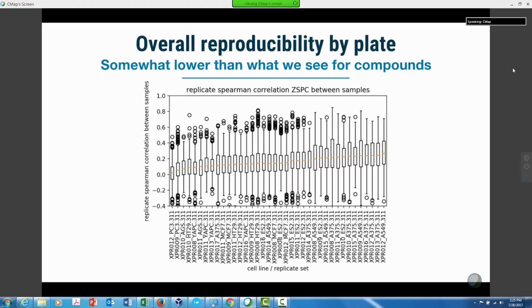One thing that I'm still exploring is that when you look at within-plate reproducibility, the values tend to be lower than what we've previously seen. On the one hand, this makes sense because, first of all, we aren't getting perfect infection efficiency, and unfortunately, even having cells be infected does not necessarily imply that the knockout is actually occurring.